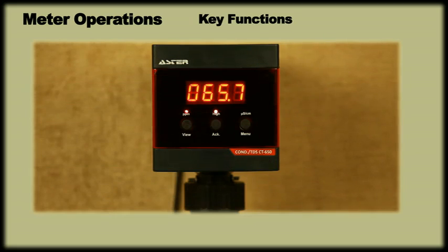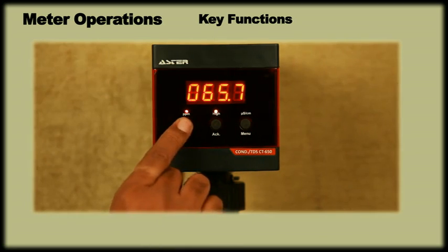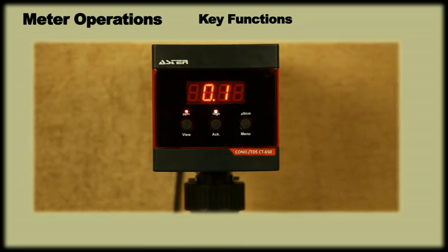As you can see, it has three programming keys: View key, acknowledge key and menu key. The view key displays factory settings like cell constant, calibration factor, output on and output off values and address.